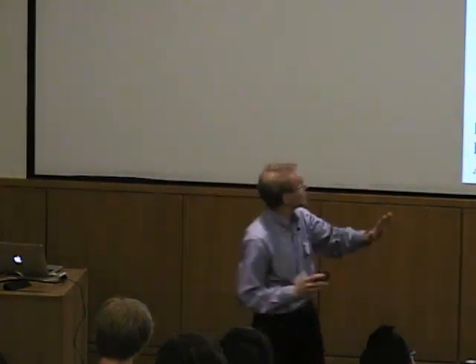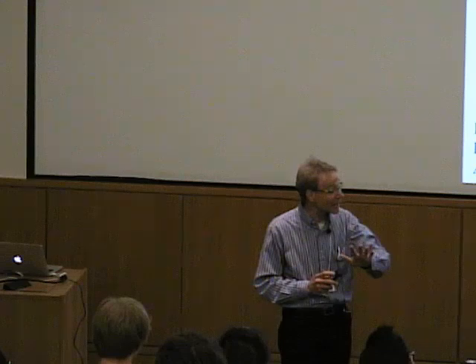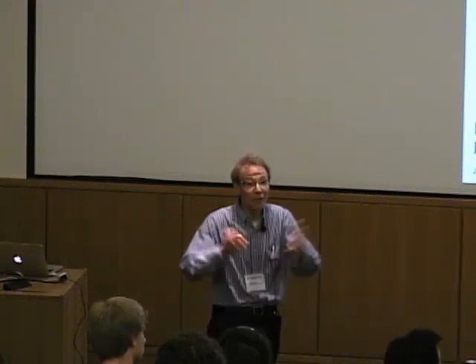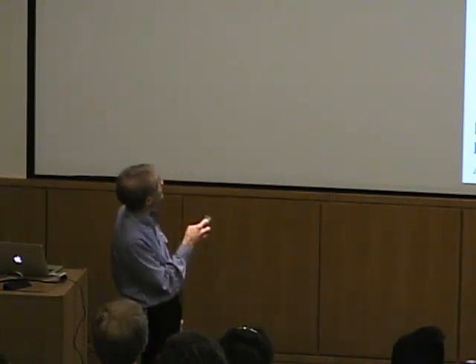Okay. But Jeremy Berg, I mean, amazingly smart guy, head of NIGMS for many years, recently appointed editor of Science magazine. I mean, a real pioneer. And so I really want to give him credit for saying, you know, here's something that ITC can do. It can tell us information about metals binding to proteins that are very well studied, but we learned something new about the thermodynamics. Okay, here's the data they published.